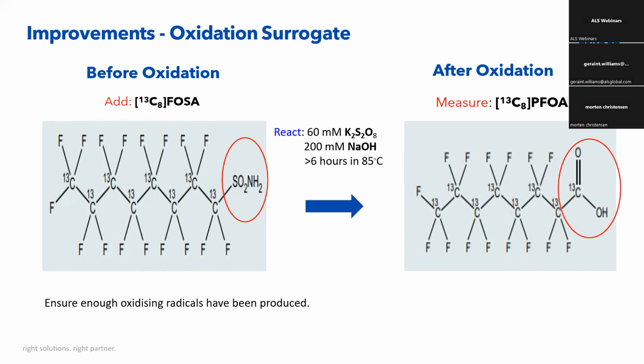And it can be used for samples with high total organic carbon, those kind of issues that I've just mentioned. That can be used to determine the extent to which those scavenge the hydroxyl radical. So it's like a quality control measure almost. It's useful for that purpose, and it is used by our labs in the US.